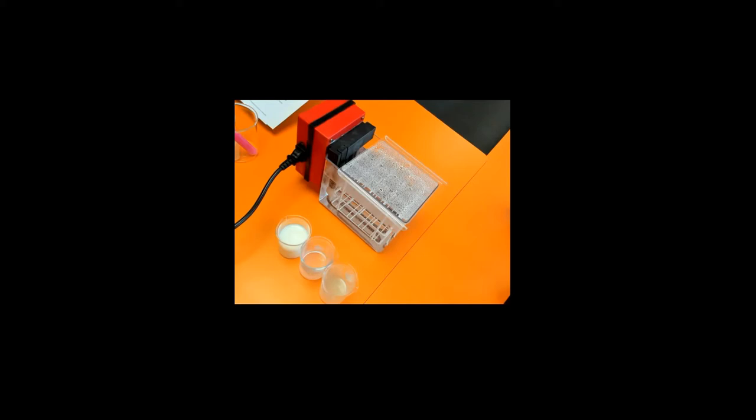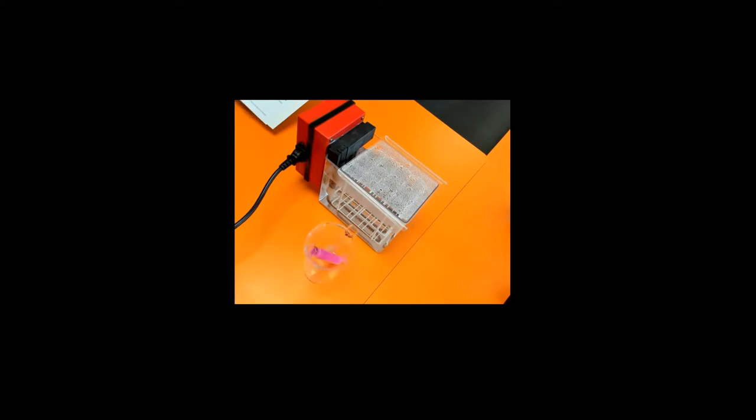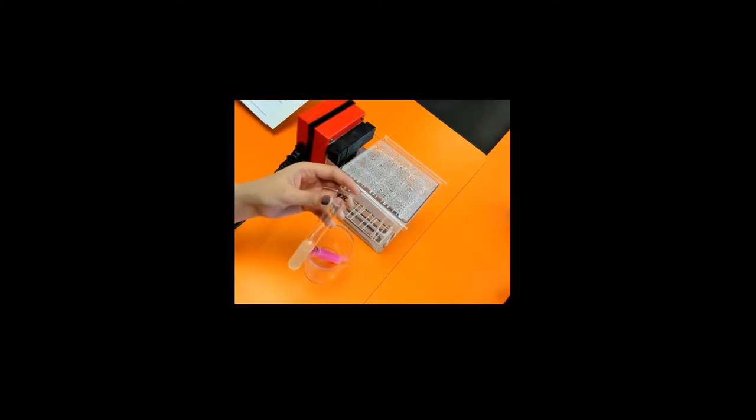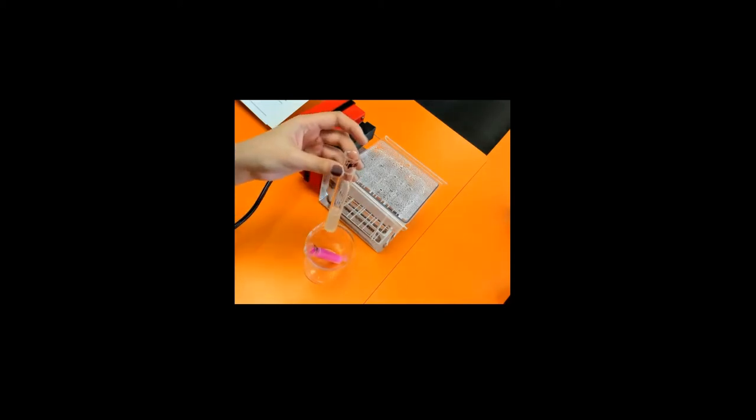The other two beakers contain lipase and sodium carbonate. Over here I've got two test tubes. In the first test tube, labeled lipase, it only contains lipase solution.